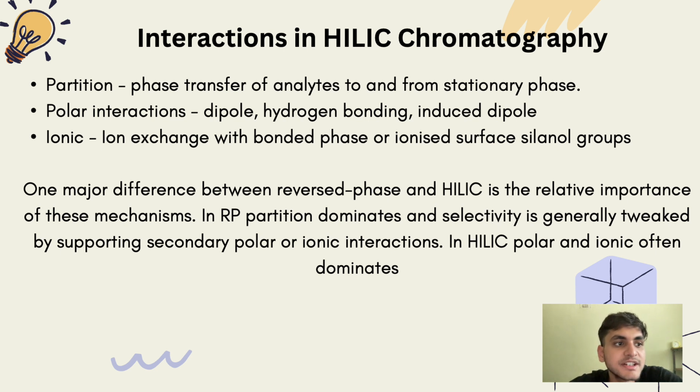Considering this, when we see the difference between hydrophilic interaction chromatography and reversed phase chromatography, in hydrophilic interaction chromatography, as we have seen, the stationary phase is the polar material. Mobile phase are organic rich solvents. In reversed phase chromatography, the stationary phase is the hydrophobic non-polar material. The mobile phase is water rich with organic solvent. The separation mechanism in HILIC chromatography would obviously be hydrophilic interactions, whereas in reversed phase chromatography it would be hydrophobic interactions.